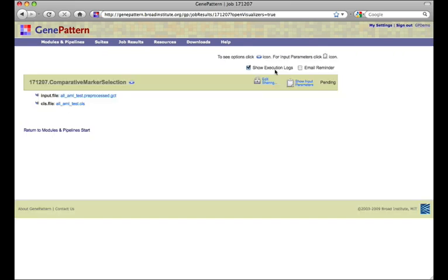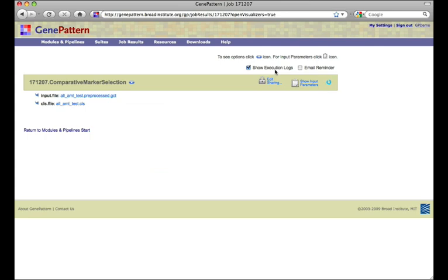When that is complete, we take time to examine the results, perhaps passing them to peers for evaluation and discussion of possible next steps. After some discussion, we decide to extract a dataset and feature list file from the results of comparative marker selection, both to save and to use later in other gene pattern modules.